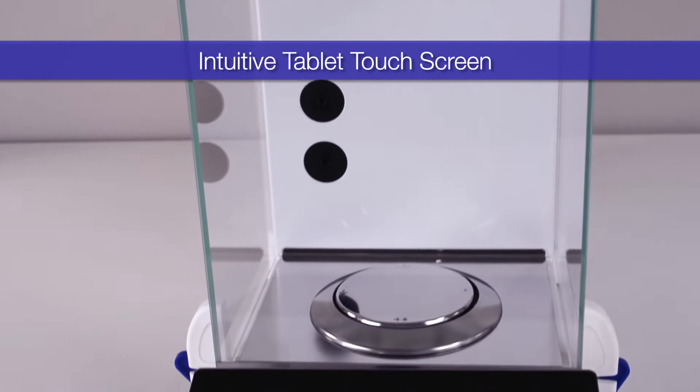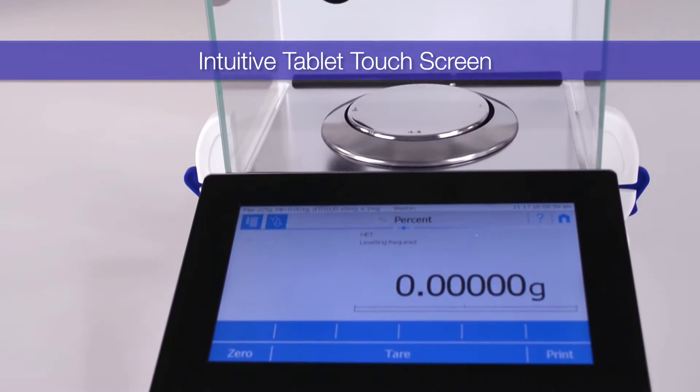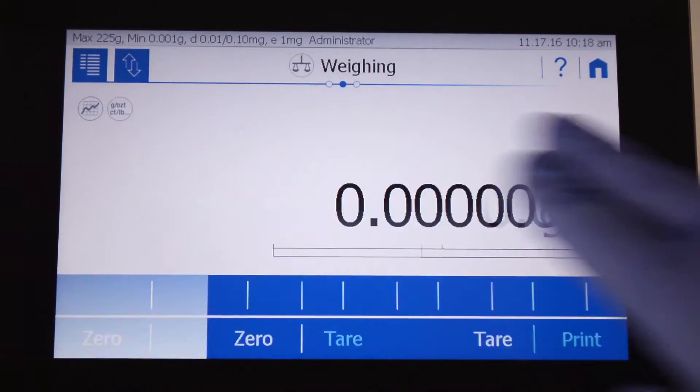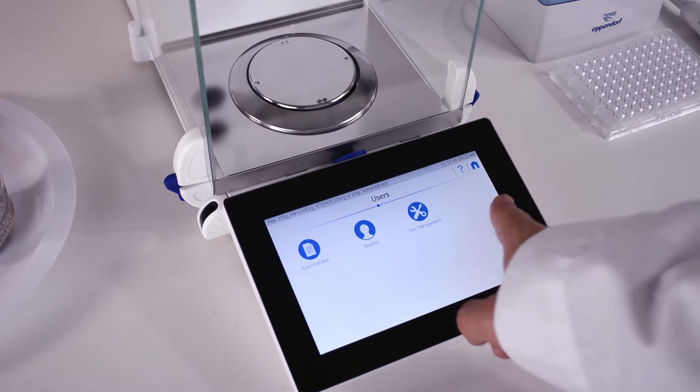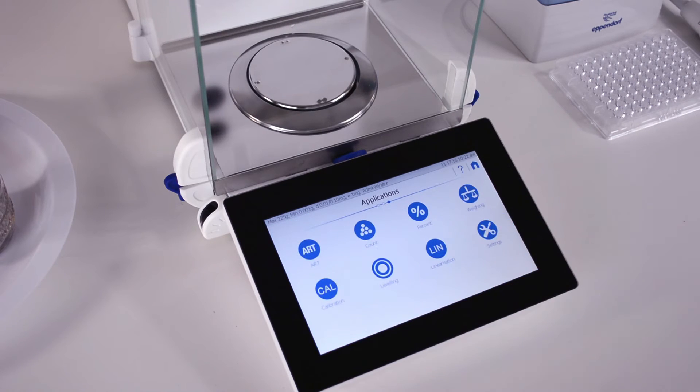The Precisa H series' greatest feature is its tablet touchscreen with software especially designed by Precisa from the ground up. You can swipe, scroll, and tap to navigate the menus.